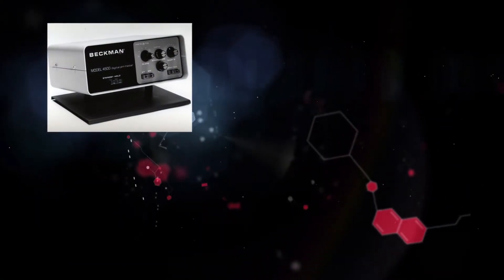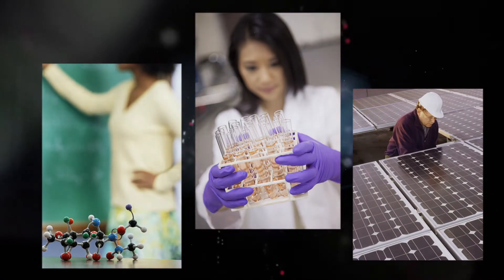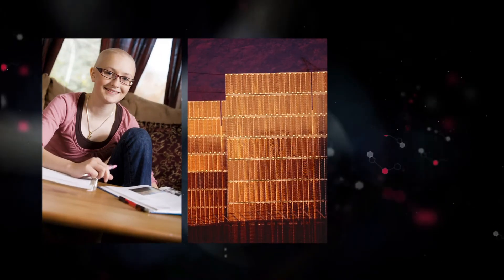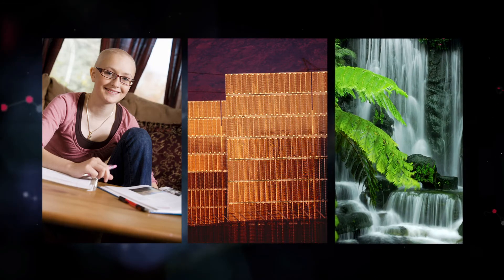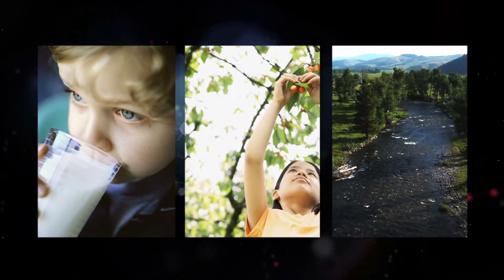Today, the pH meter is an essential scientific tool found in laboratories everywhere. From basic science to medicine and manufacturing, pH measurements are used to control patient treatment, manufacturing processes, and the environment to ensure the quality of our food, our soil, and our streams.